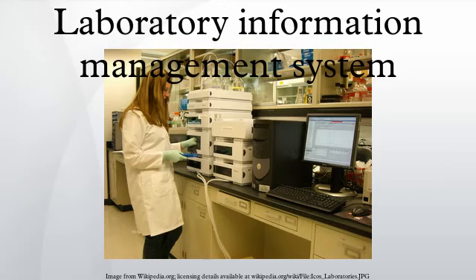LIMS users may also have regulatory concerns to comply with, such as CLIA, HIPAA, GLP, and FDA specifications, affecting certain aspects of sample management in a LIMS solution. One key to compliance with many of these standards is audit logging of all changes to LIMS data, and in some cases a full electronic signature system is required for rigorous tracking of field-level changes to LIMS data.